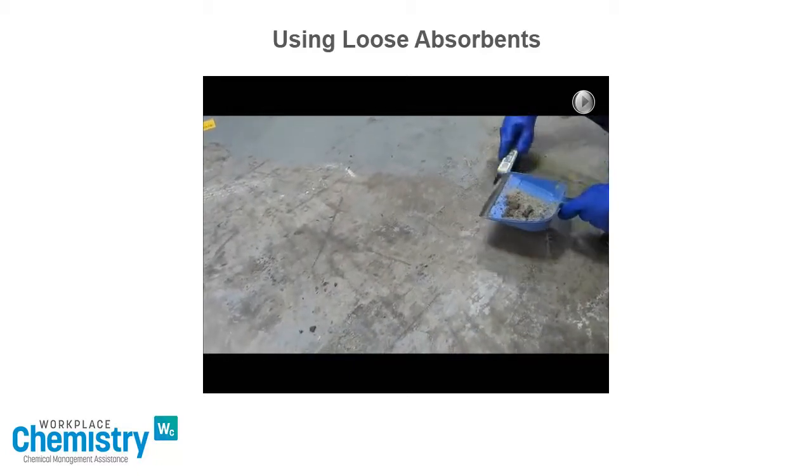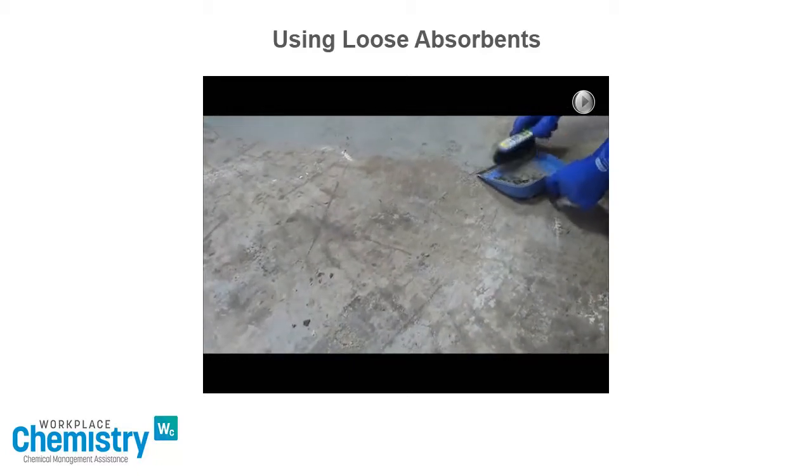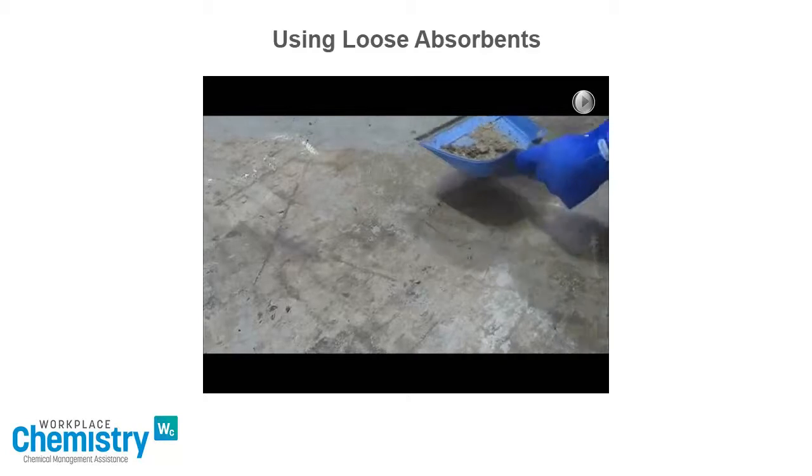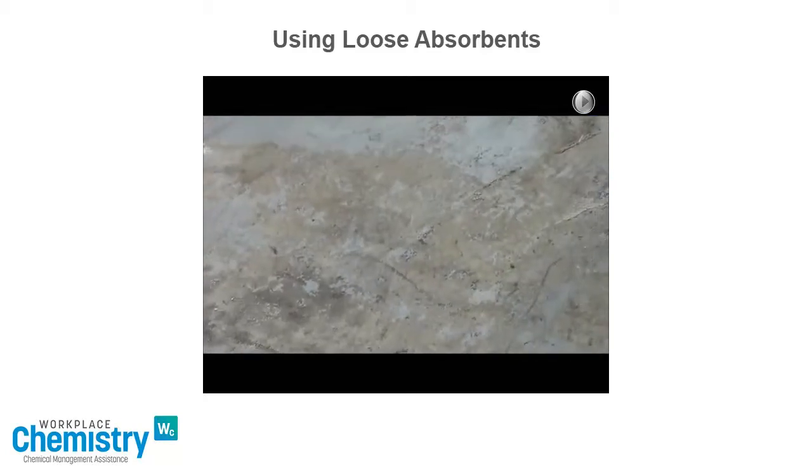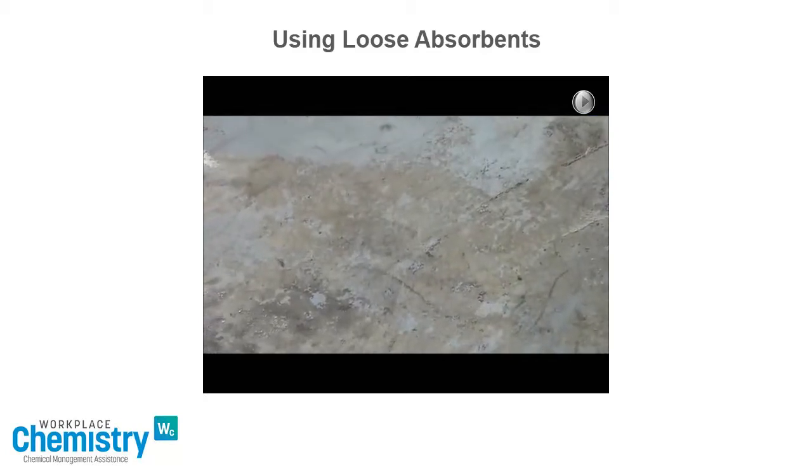And that's how we clean up a spill using loose absorbents.